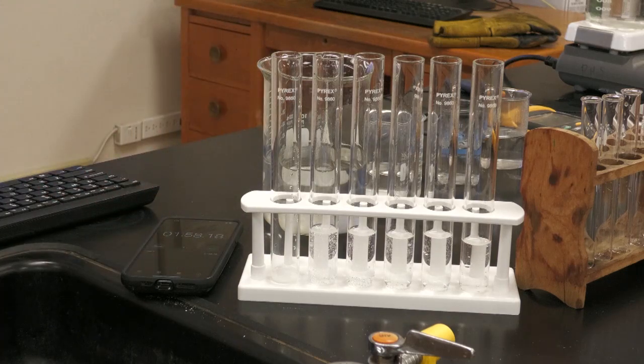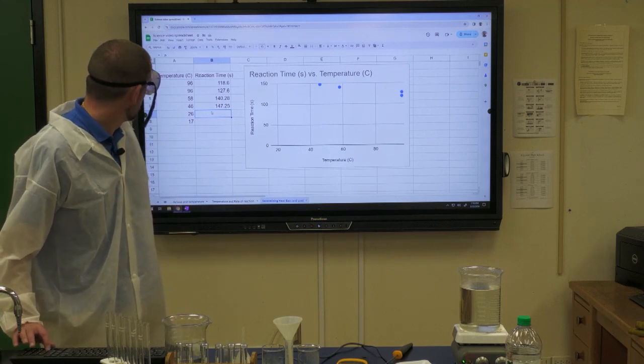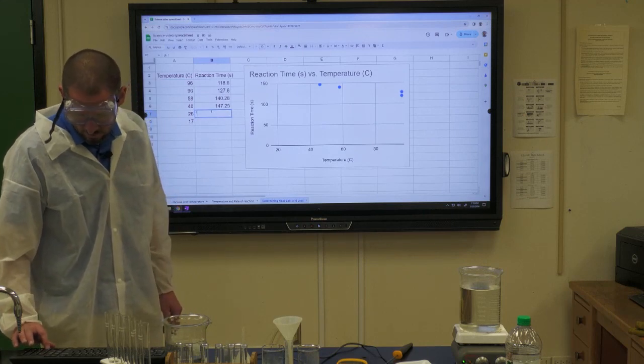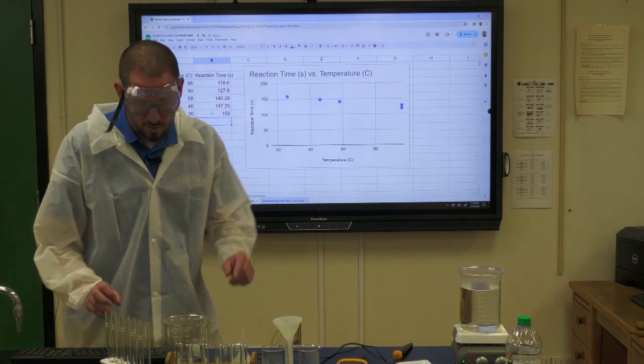Okay, I stop hearing it now. We end up at approximately 158. And then the last one.